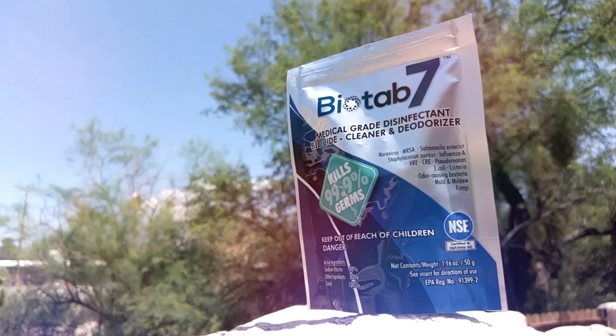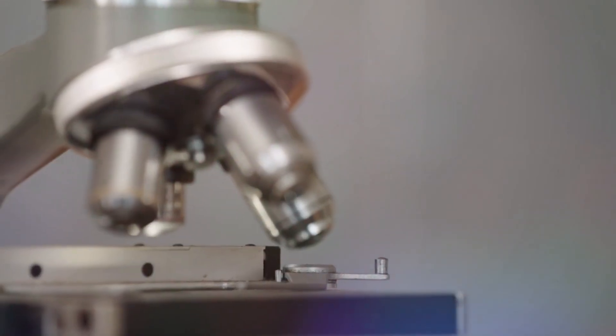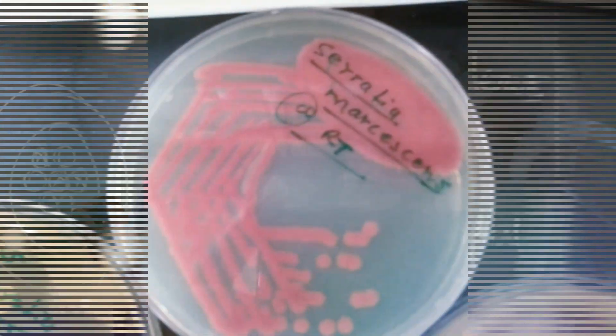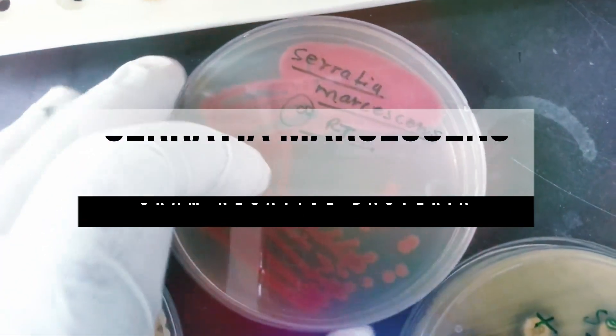In fact, Bio Tab 7 can destroy all three types in one petri dish at the same time. We asked an independent lab to put this to the test and cram one of each type of bacteria together to see what Bio Tab 7 could do. For the gram-negative, they selected Serratia marcescens, which shows as red.